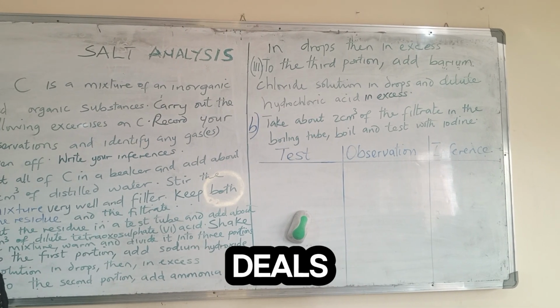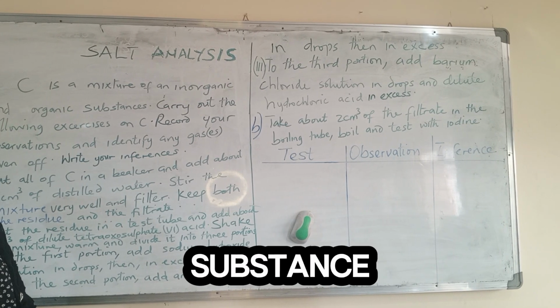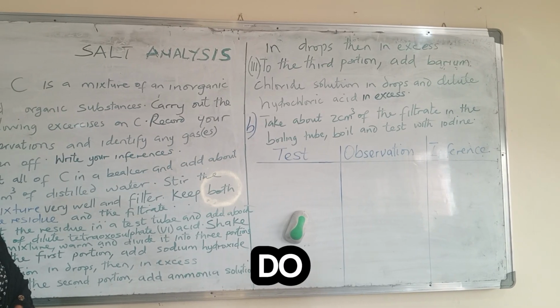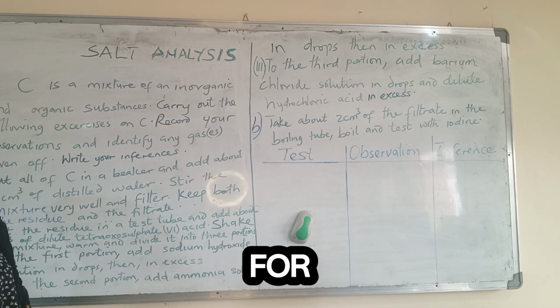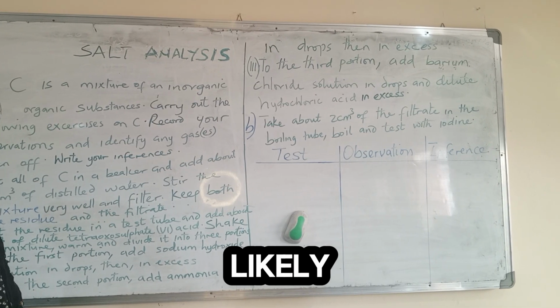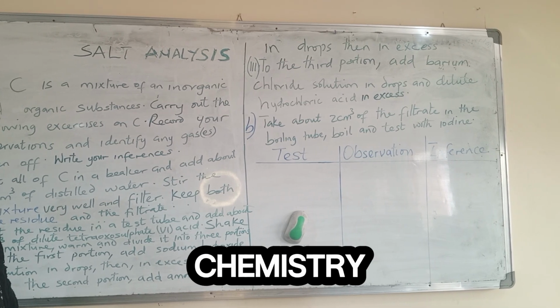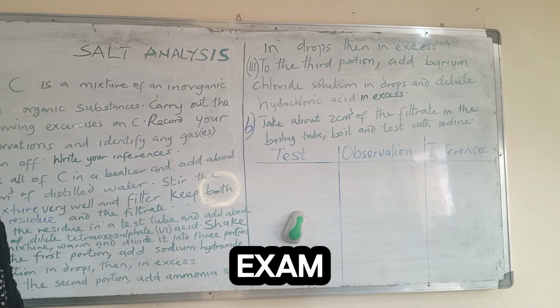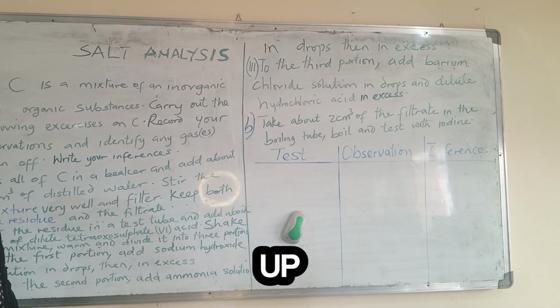Qualitative analysis deals with what is present. You have to identify an unknown substance, an unknown sample, but basically we do salt tests. So we want to prepare you for what you need for the 2026 WAEC chemistry practical exam. So you need to just follow up.